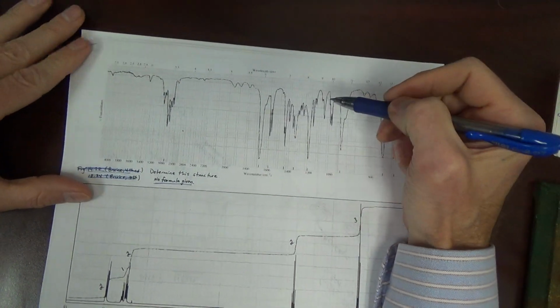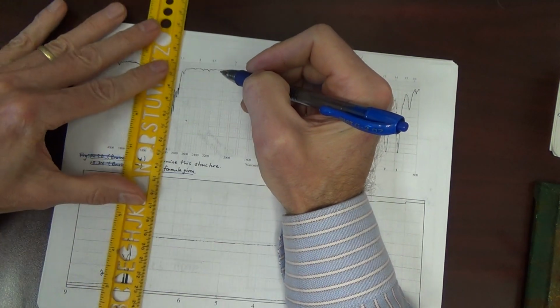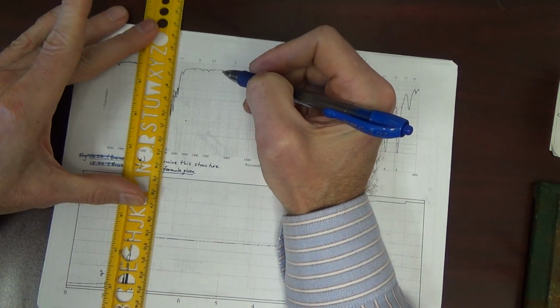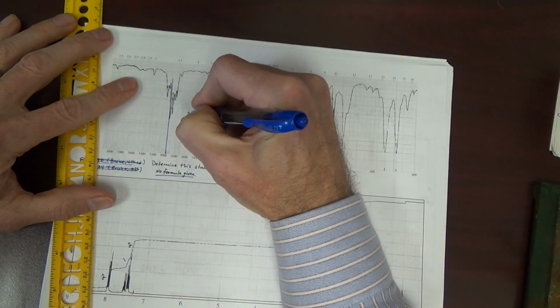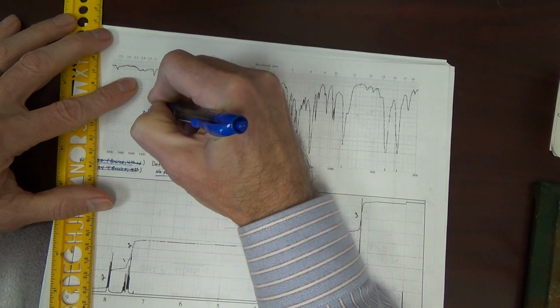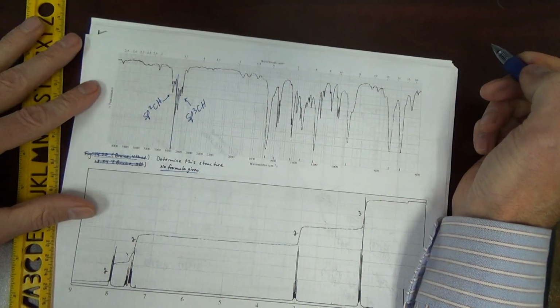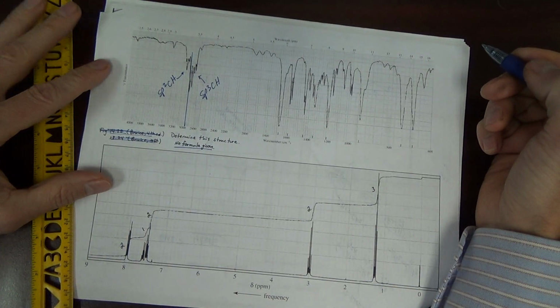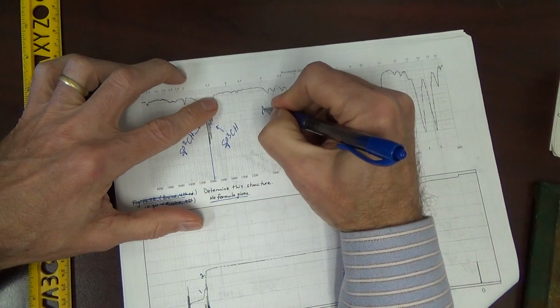Let's take a quick look at the IR. What do we see? I see sp3 CH, but I also see sp2 CH. A little small something here. Looks like an aromatic to me.